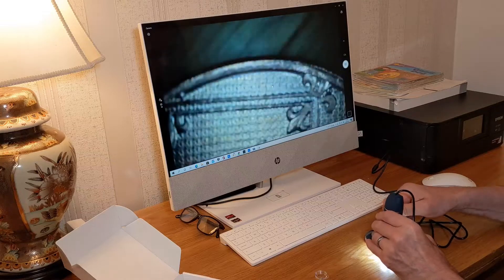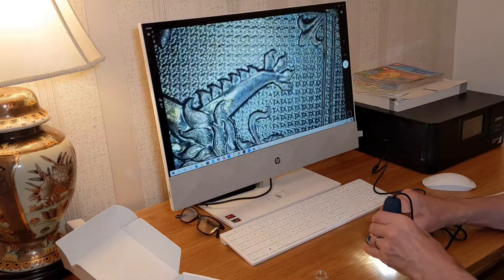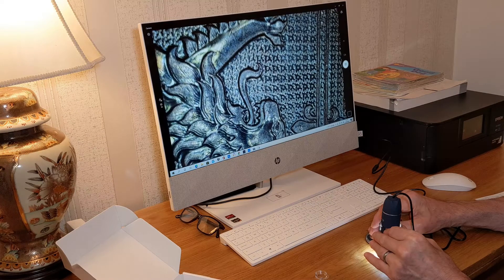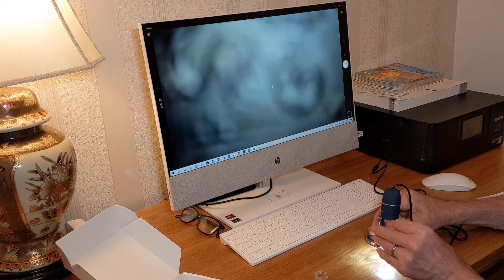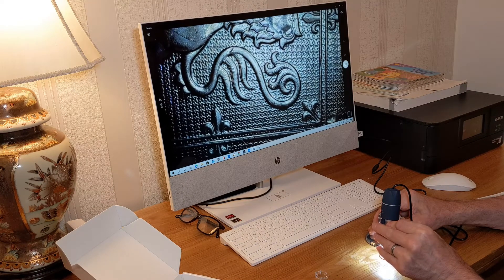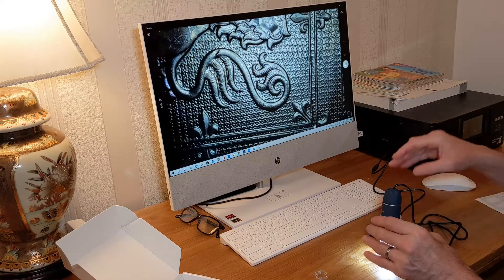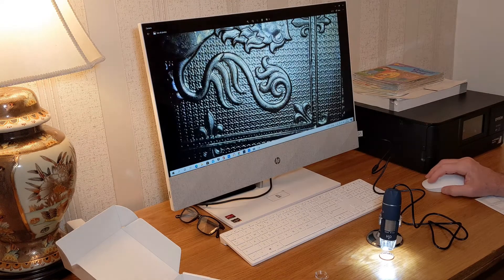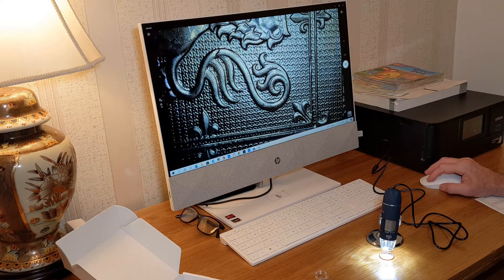I need to tighten that up a bit. You can just focus it in a little bit - you can go further away and then just focus that in. I'm pretty happy with it, it's a very clear image. If you want to, you can just take a photo - click - and there's that photo. You can do a video as well if you wanted to.